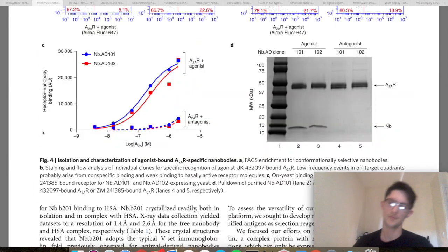So to sum up, yes, the authors of this paper have designed an enormous nanobody library with clear selectivity for multiple different proteins, be they soluble proteins or membrane proteins, and they have shown quite elegantly how one can use this to acquire a nanobody which stabilises the desired conformation of your protein. This could be excellent, not just for structural biology, but for finding sensors for things, for pulling stuff down out of environments, and then ultimately combined with structural biology, drug discovery.